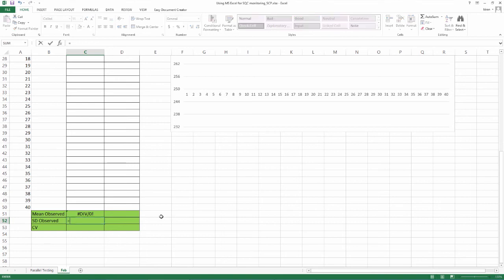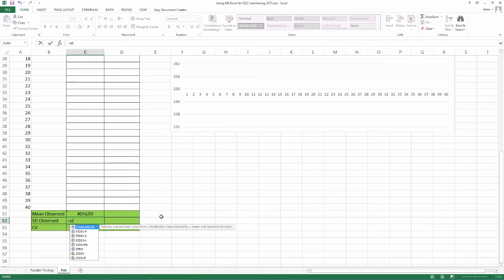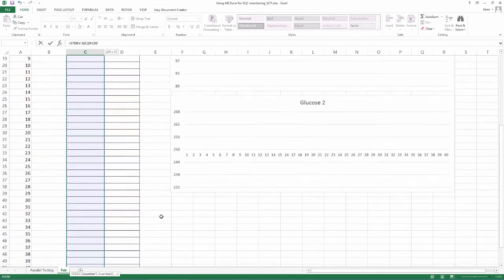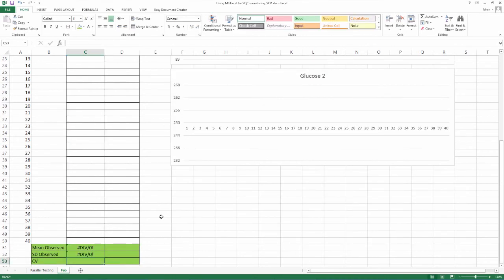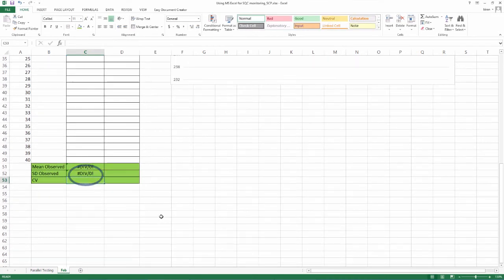Go to the observed SD slot and repeat as we did in the parallel testing. Insert equal to, type STDEV.S, open bracket, select all 40 cells required, close bracket, press enter. Again, the error code div by 0 will appear as there are no current value inputs.